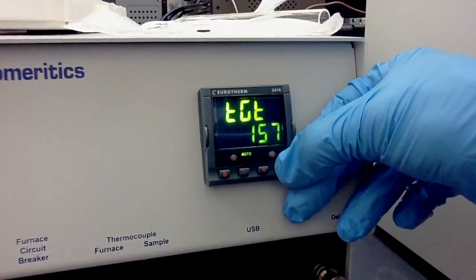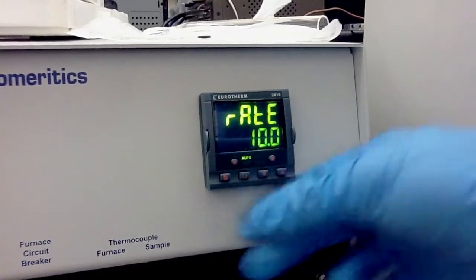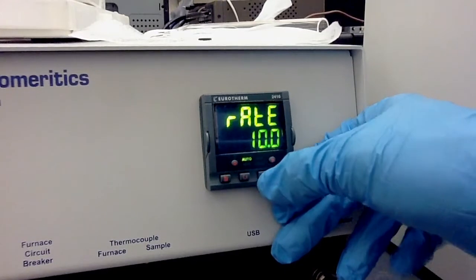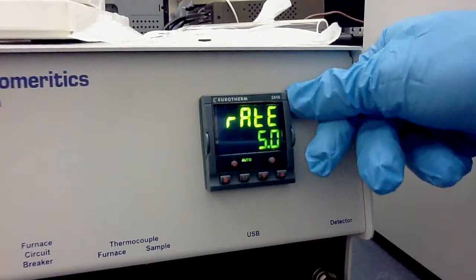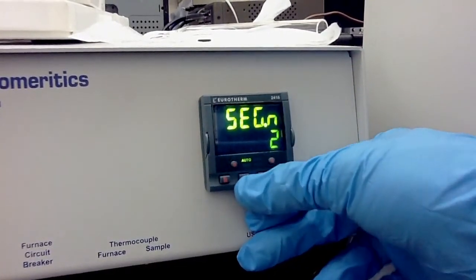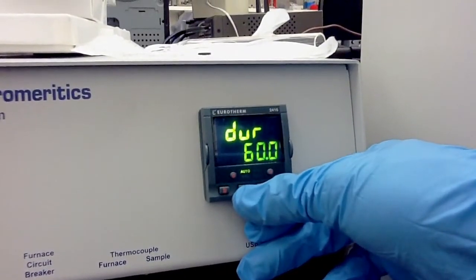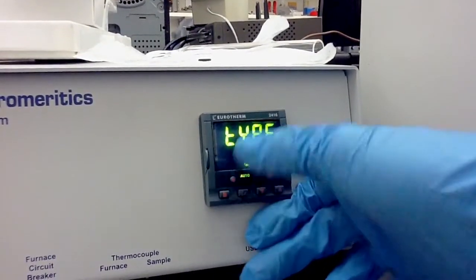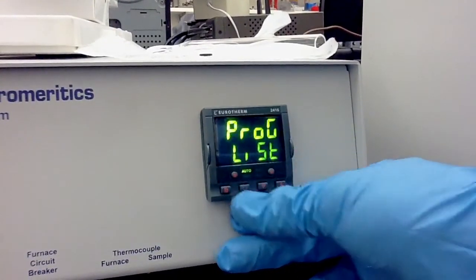So temperature is set for 800. Now this is ramp. For my test I need this one to be 5 degrees Celsius per minute, so I will lower it down to 5. So we set the ramp rate of this experiment to 5 degrees per minute. Next segment is what it will do after that. It will stay on this temperature for 60 minutes, and after that it will stop this experiment. In segment 3 it will end the experiment, and then select hit. It will go back to the program list.